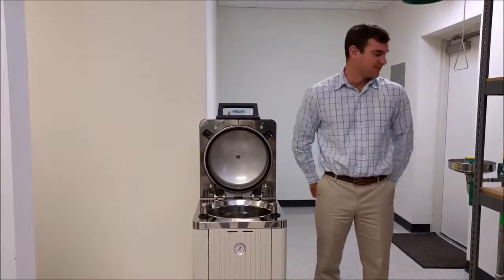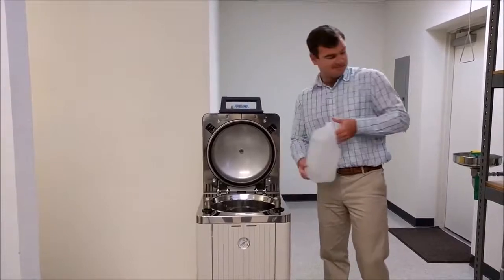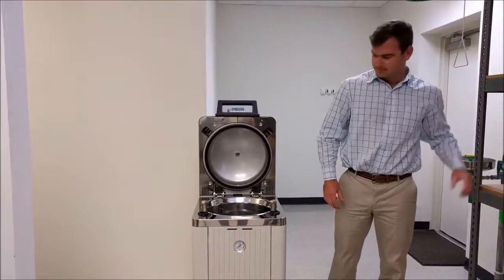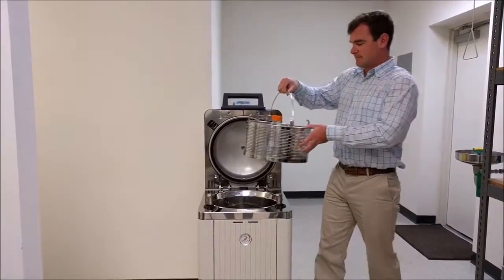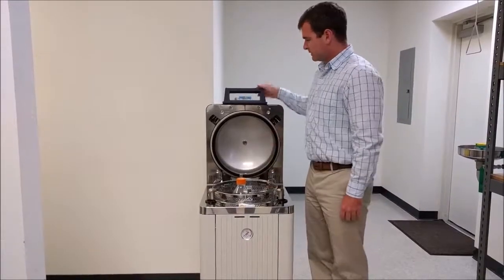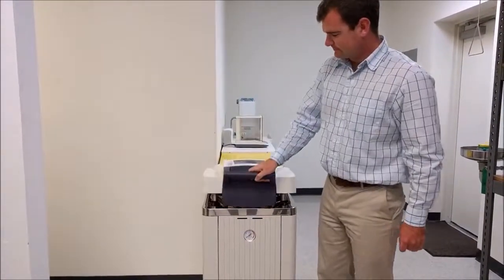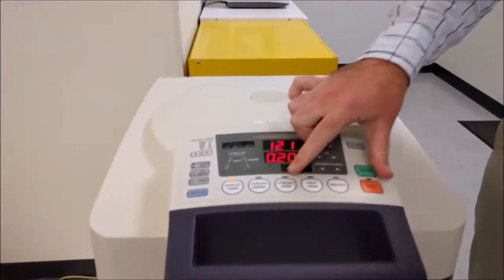The operation is very simple: simply add water to the system, place your sample in the basket inside of the chamber, close the lid, and simply set your sterilizing mode here.